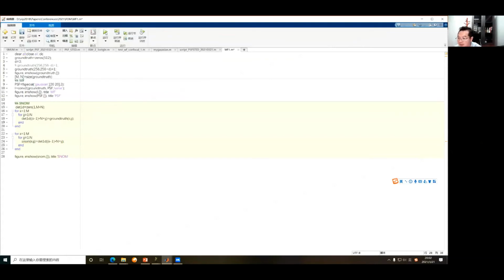Okay, now we can comment the PSF line and let's run it again.